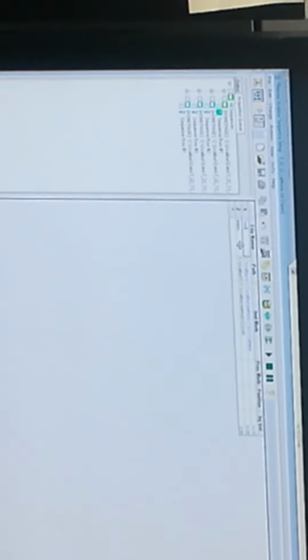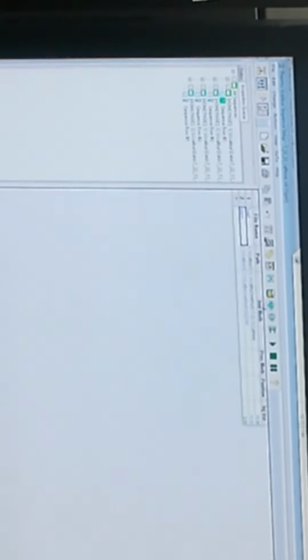Yes. Change the name. Nope, you have to highlight the clean now. And one more time. You see how it adds it every time? So every time there'll be a total of 3, and there's 5 of you guys, so in total it should be 15. Okay, now go to the HPLC.